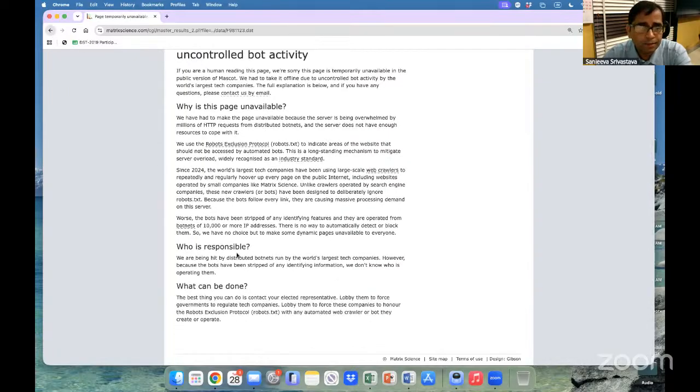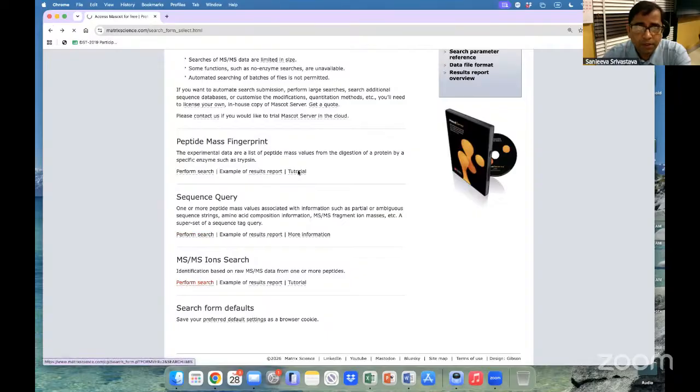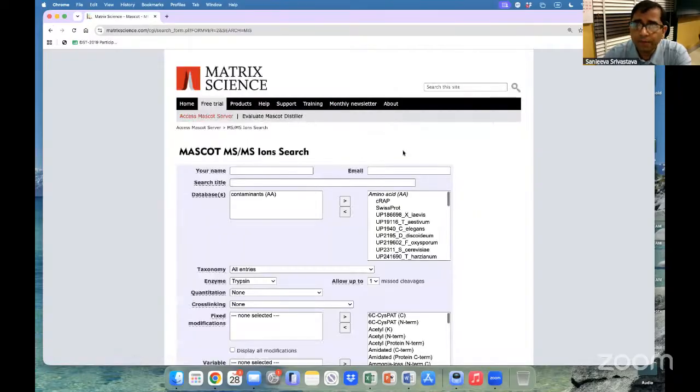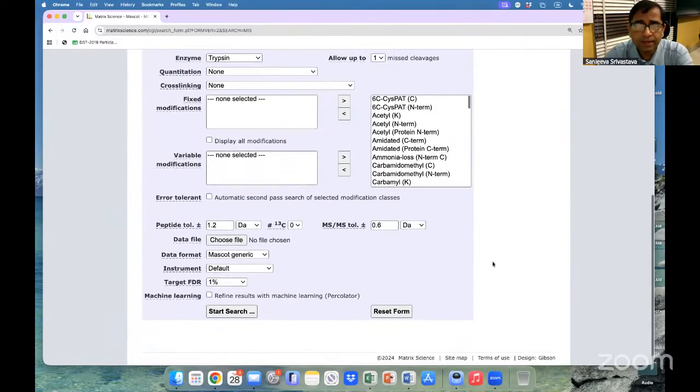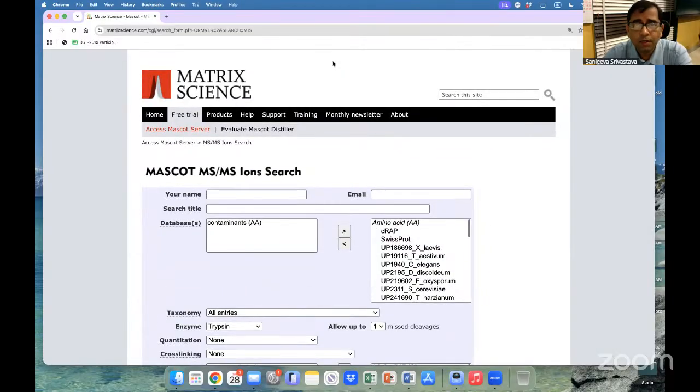Currently it looks like there is some issue with this page. You can look at different parameters and how to identify the protein. We will have a more dedicated session on analysis as we go along. But right now, I just wanted to preempt that the data which you just acquired can be analyzed with different types of software, and one of these is shown on the screen here.